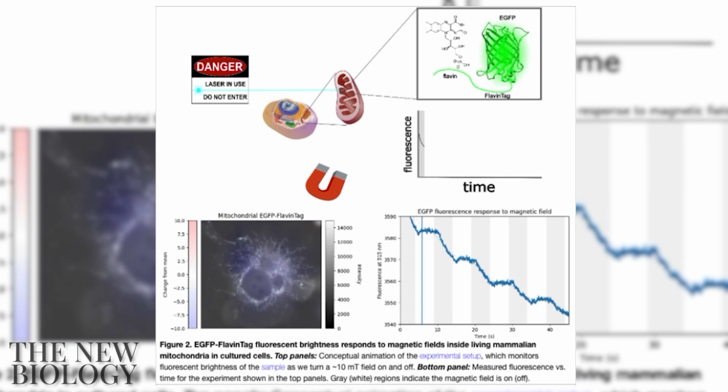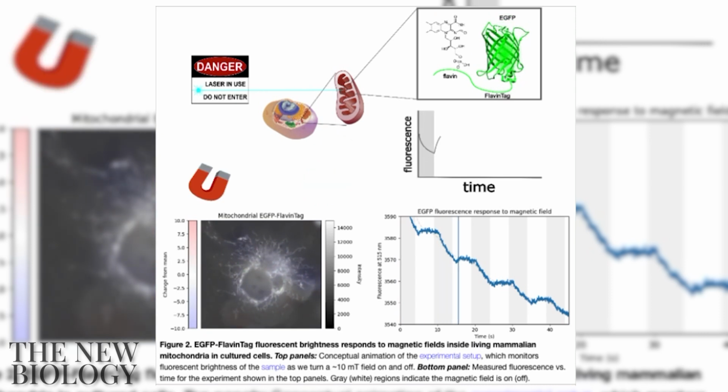And then on the microscope, I had a little servo motor that would move the magnet in and out. And then you're just recording this to see if there's any fluctuations. Exactly. And you have some image segmentation. Yes, usually I draw a little square and I'm like, do I see any changes?